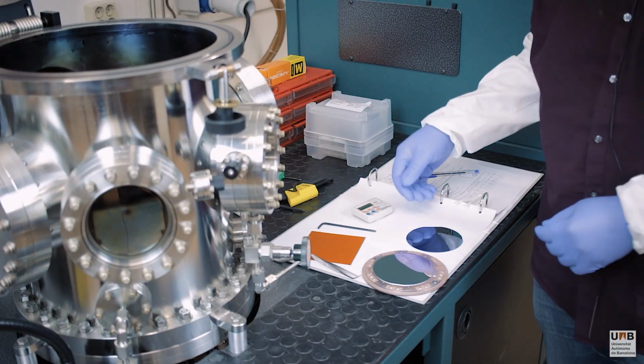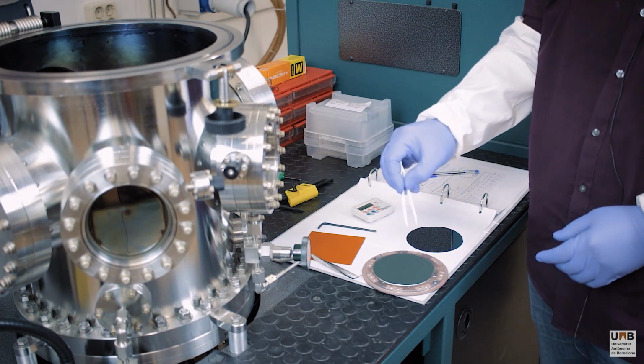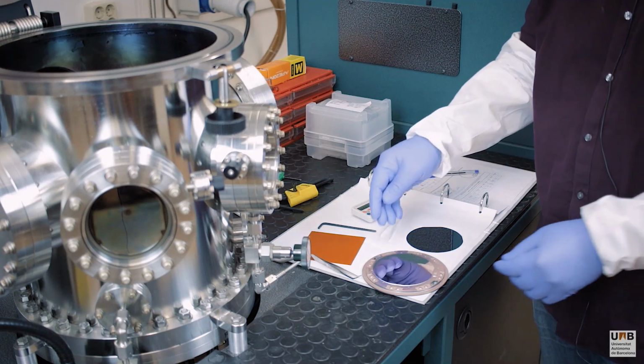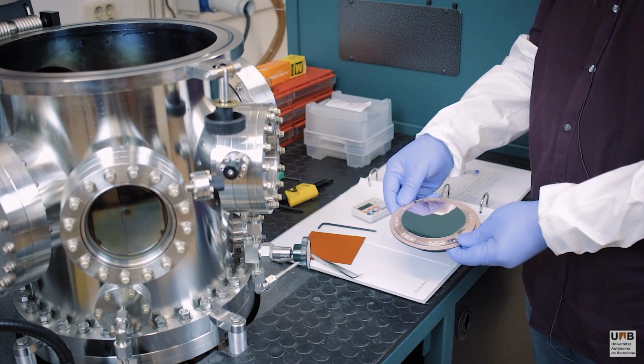Okay, and here's the final product. We have the original silicon wafer that we put in there, and this is what it looks like after we put 20 nanometers of titanium and 60 nanometers of copper. And you're done. So now you can use this as a substrate for whatever you want.